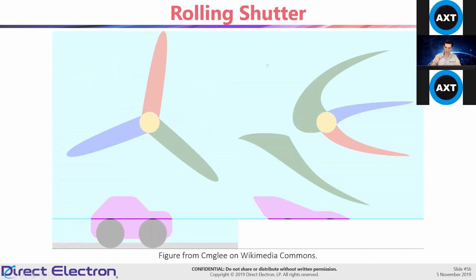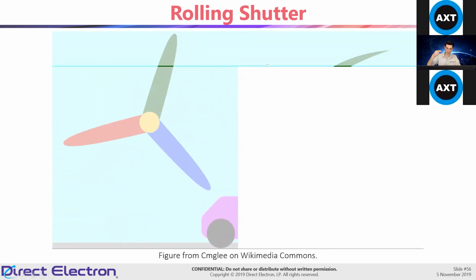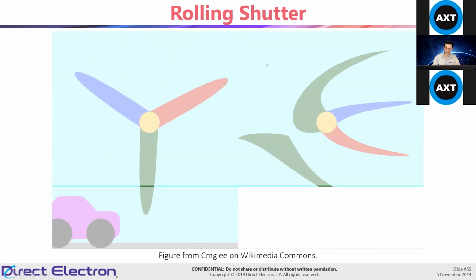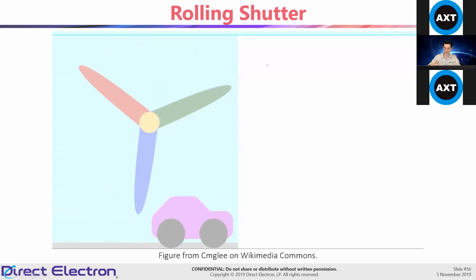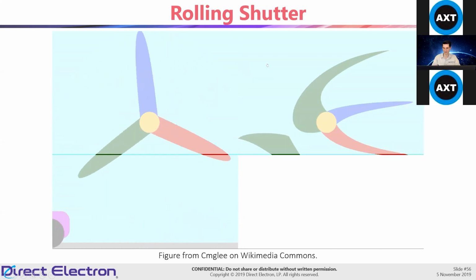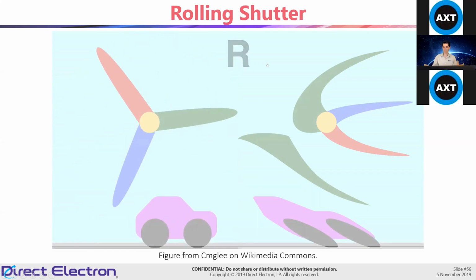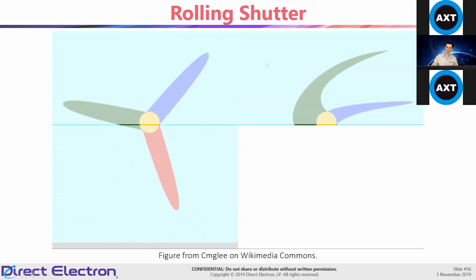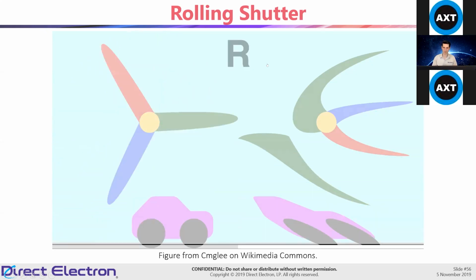If you have an object inside of your field of view that is moving, then with the rolling shutter, if it's moving either too fast or it's moving in a particular direction, then you end up with artifacts in it. So it's either going to have a gradient across the image, it's going to look strange. It could be in 2 places at once. You could have signal left over from the previous frame. And so this is the way most things work. For most exposures, it's not a problem. If you're just looking at small particles that are in ice that don't really move anywhere, it's not such a big deal. It's something that you don't really notice.